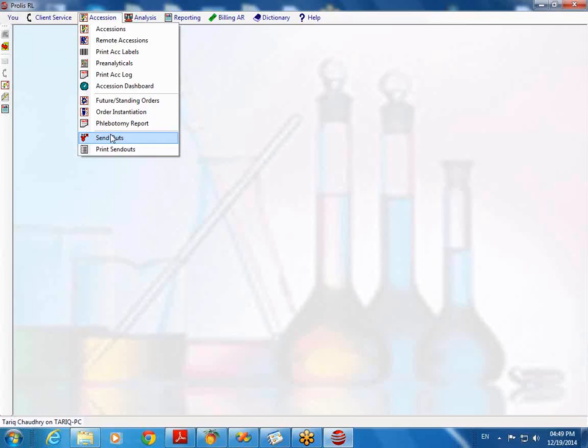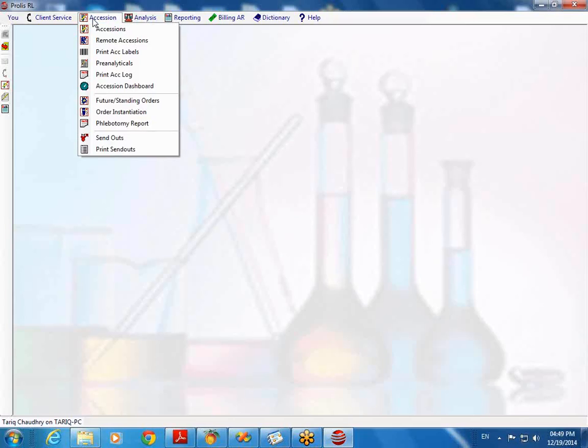So just out of curiosity, earlier you showed us a screen of all the samples accessioned in one day. Is that something that we could maybe export into an Excel format or any format for that matter? Absolutely. Actually, in relation to that, since it sounds like everything's on a SQL database, is it possible to directly connect to that database just to retrieve information? Yes. Okay. Awesome.